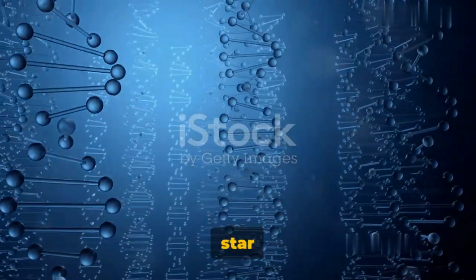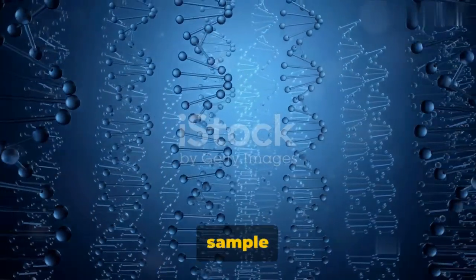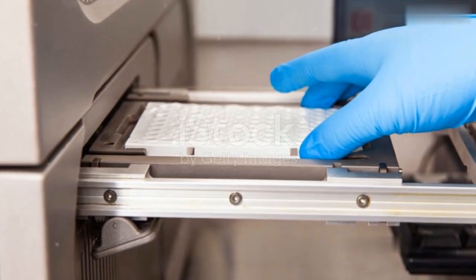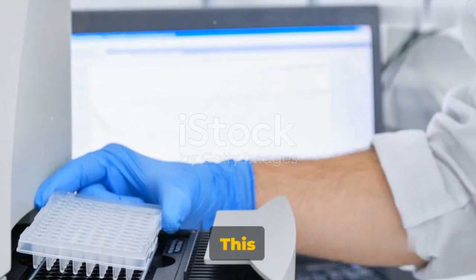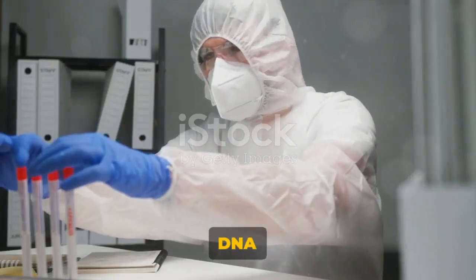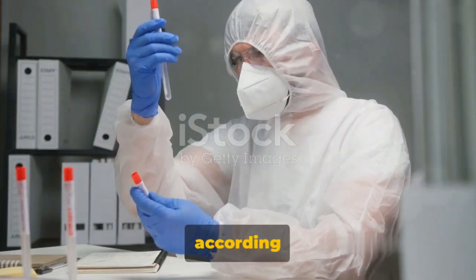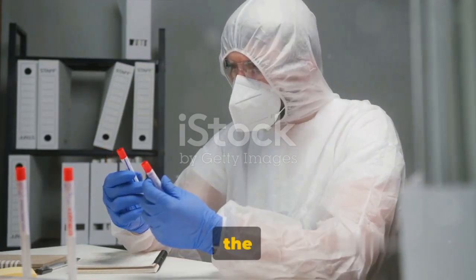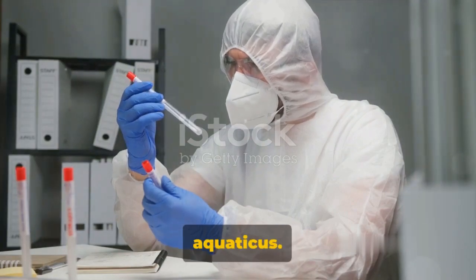This enzyme is the star of the show in RT-PCR, as it's the one converting our RNA sample into cDNA, which then becomes the template for amplification. Following the reverse transcriptase, we have the DNA polymerase enzyme. This enzyme is the master builder, constructing complementary DNA strands by meticulously assembling nucleotides in sequence according to the template strand. The most commonly used DNA polymerase is the Taq DNA polymerase, which is extracted from the bacterium Thermus aquaticus.